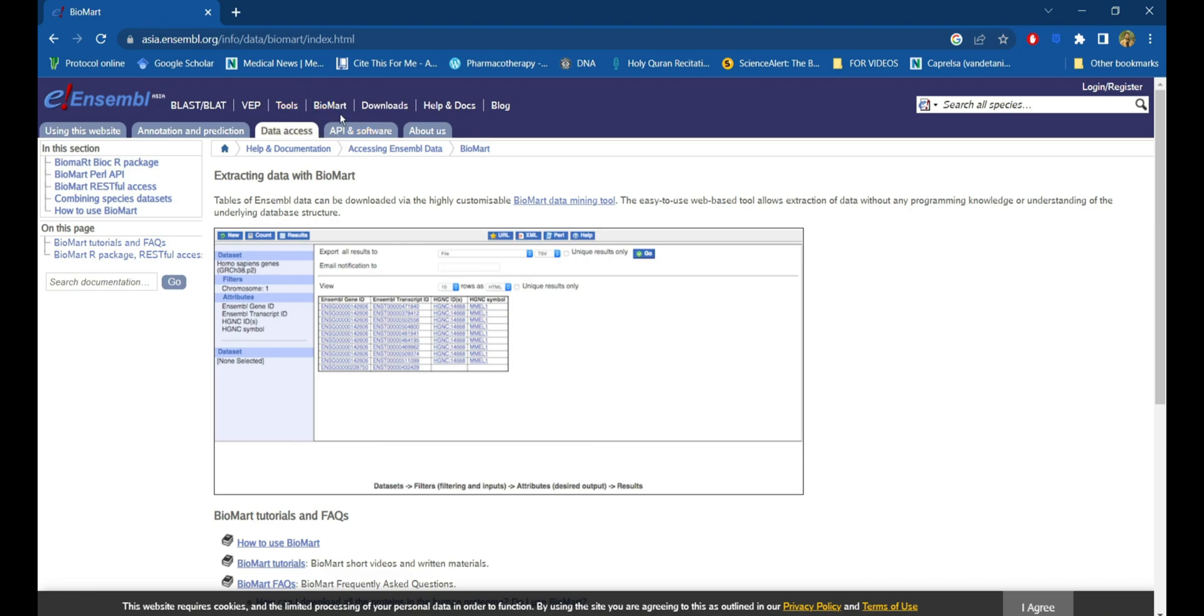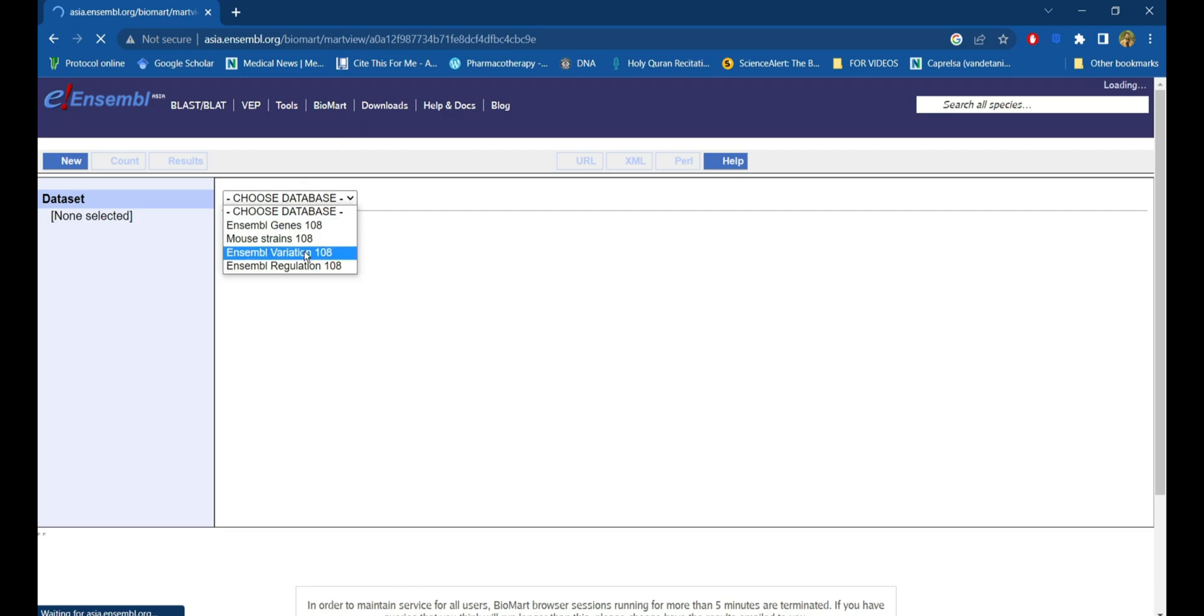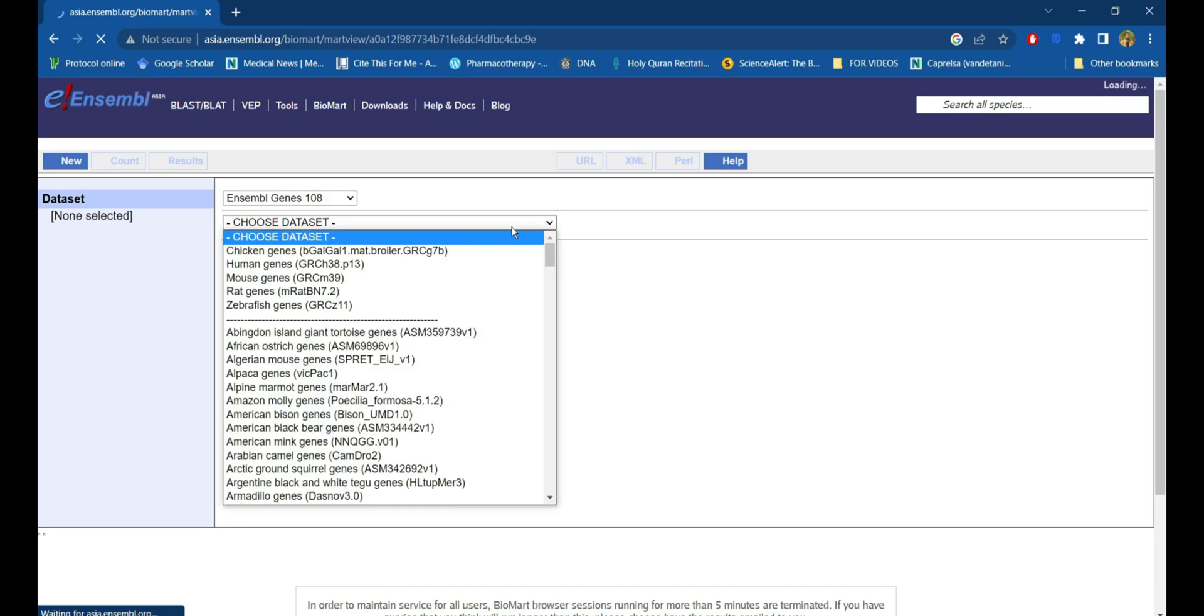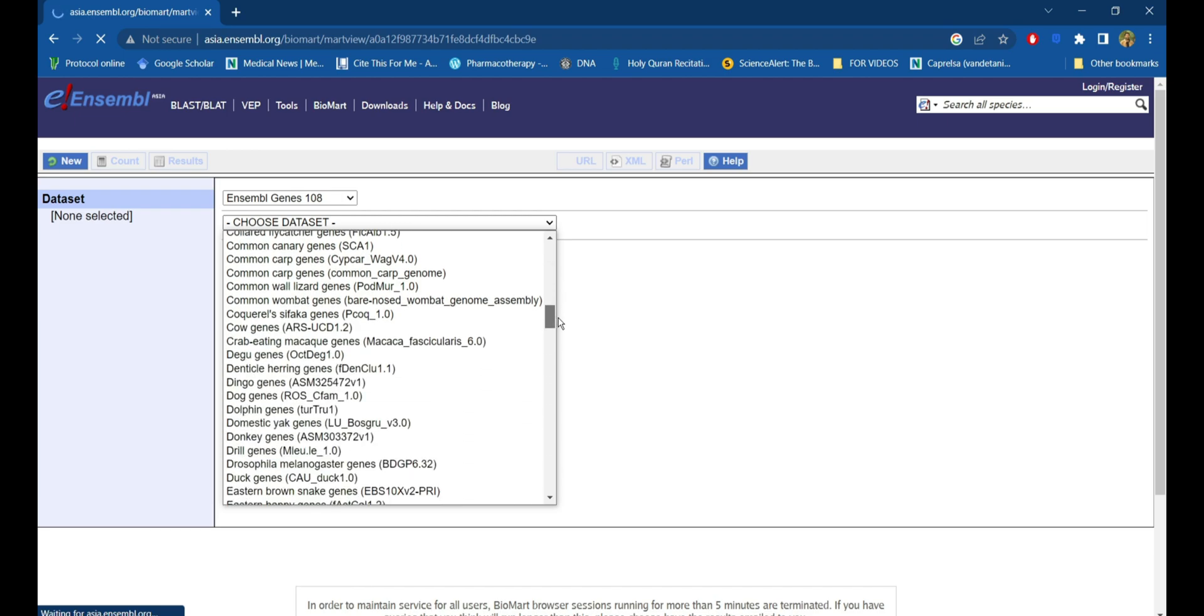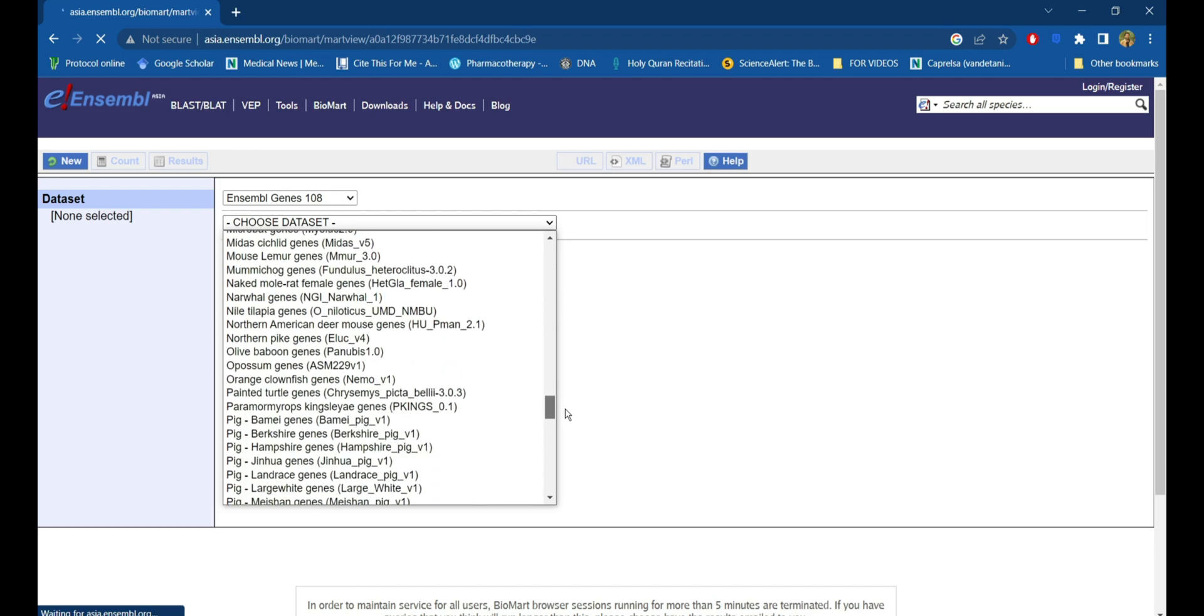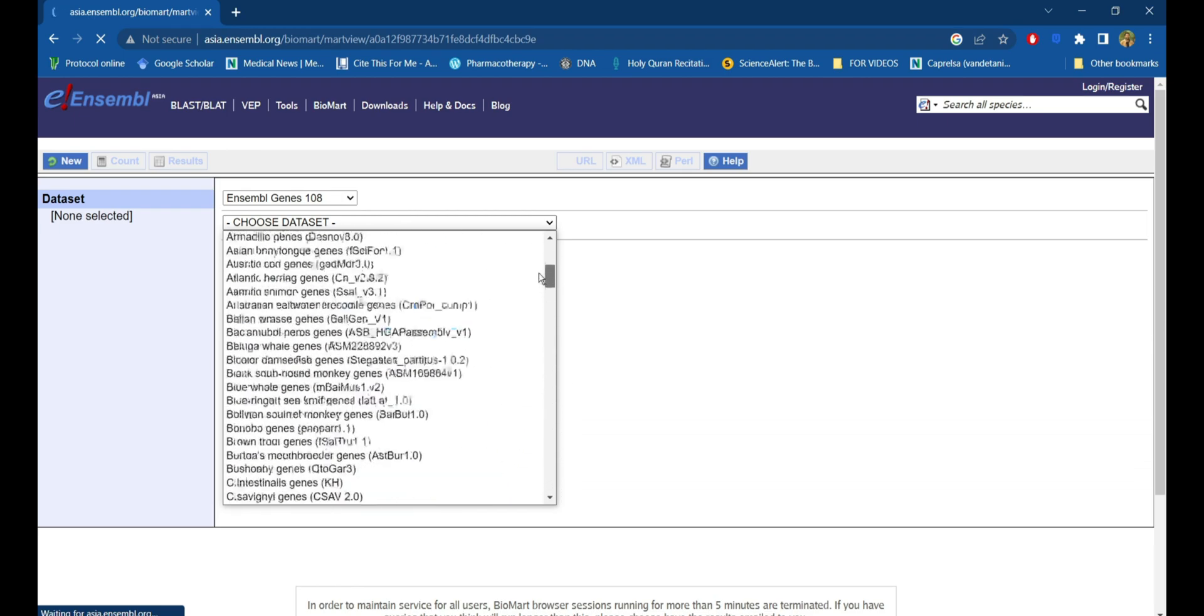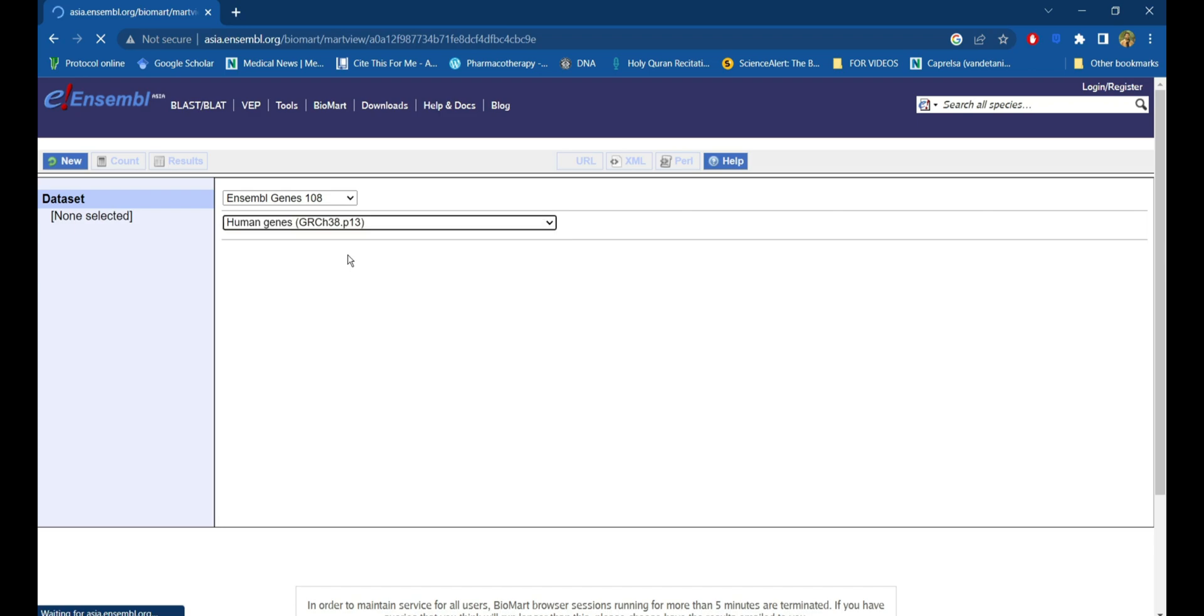Now you can choose the database which you would like to explore. Here I'll be choosing Ensembl Genes 108. Next, we will have to select the dataset of which species we want to explore. There are numerous species, out of which I'll be choosing the human genes GRCh38.p13, which is the latest dataset from the Genome Reference Consortium.